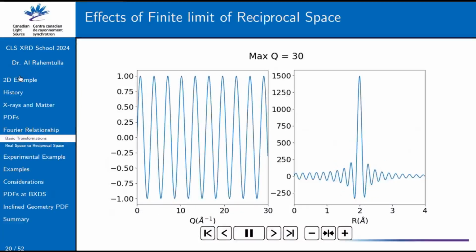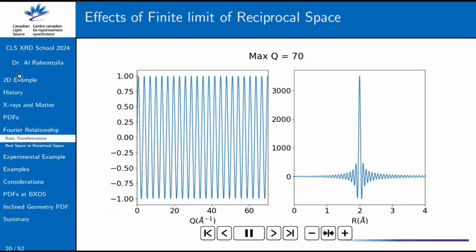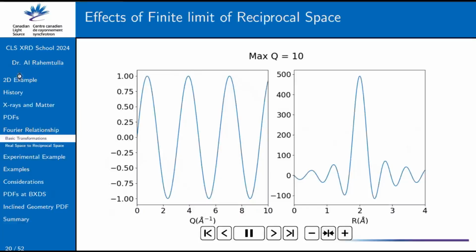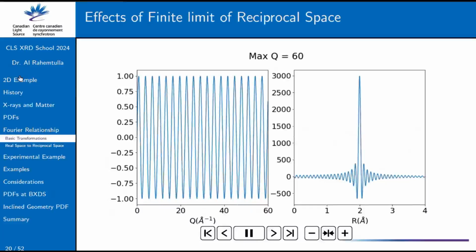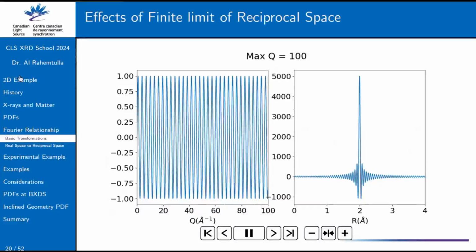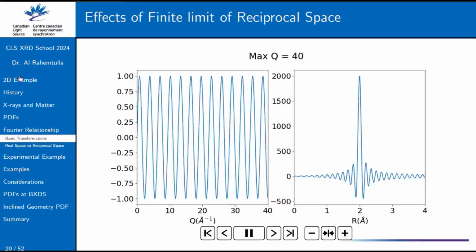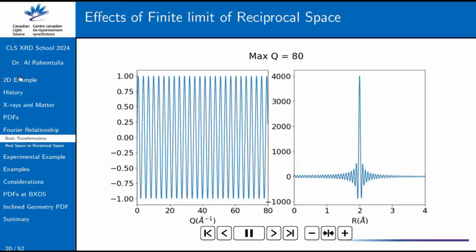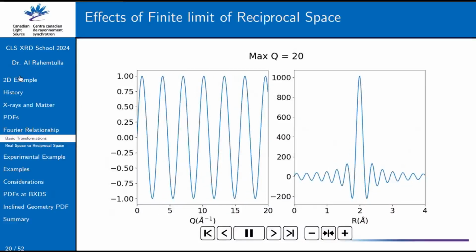I've seen a couple at 15, but especially if you're comparing things where the ordering is close, like within an angstrom of each other, a lot of that can get washed out, and you might not get anything meaningful from it. It would only take you 3 minutes to compare PXRD to PDF in GSAS, and you can. Yeah, I would say if you want, you can always try. Give it a shot.